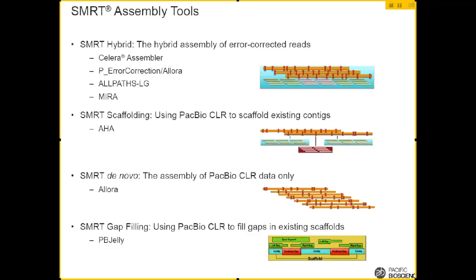And then you take a bunch of your short reads and correct your long reads, so the long reads have been corrected to what you think they are based on the short reads. This is one way to use the longer read system.